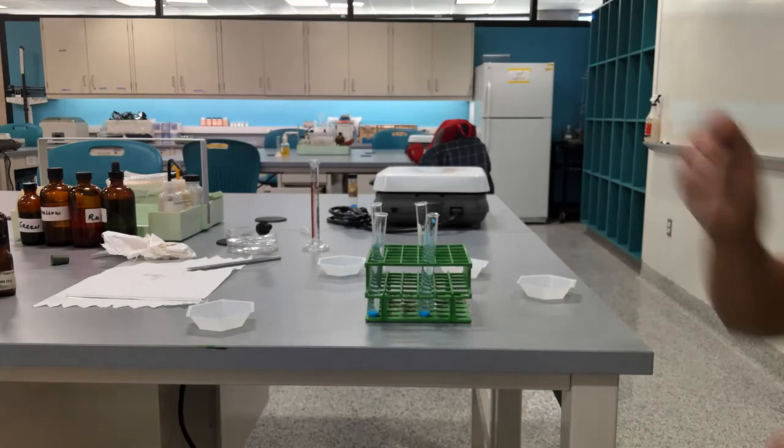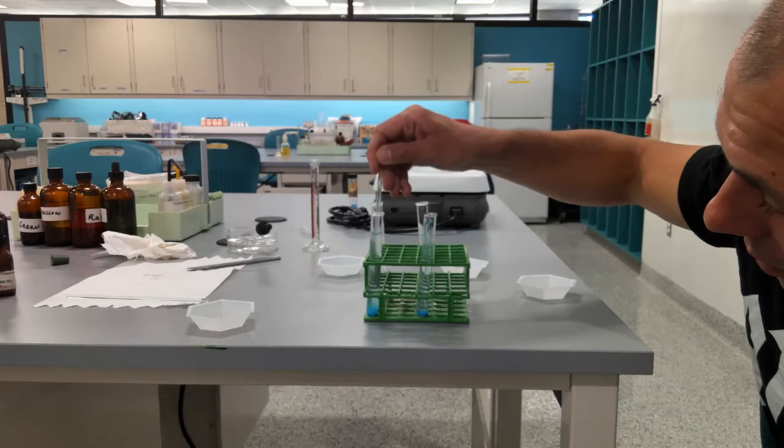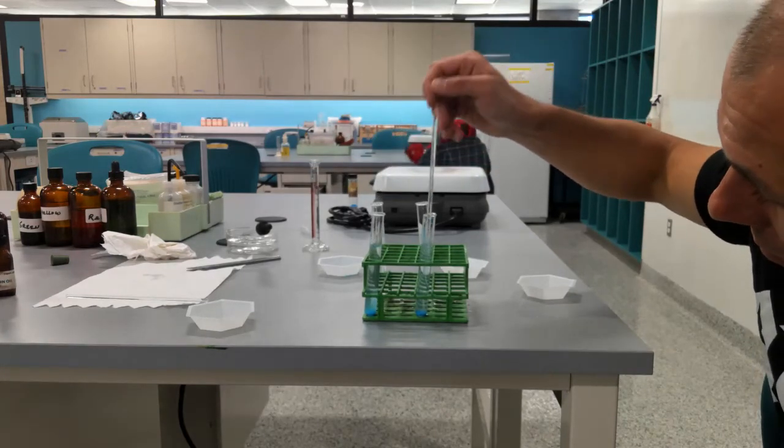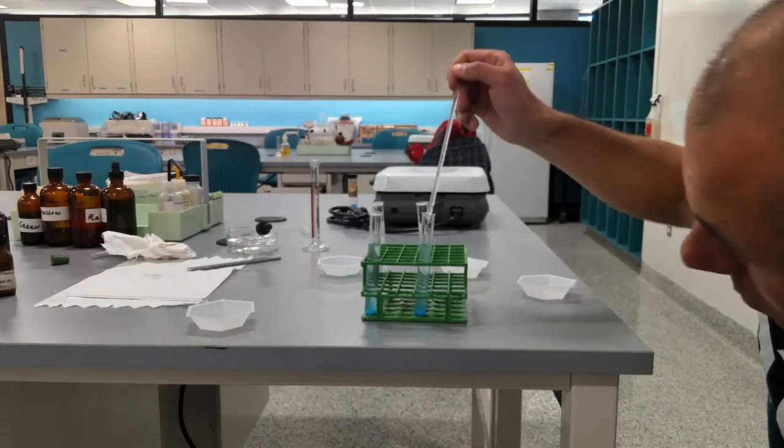And then I'm going to take a stirring rod and I'm going to stir it a little bit here, and I'm going to stir it here.